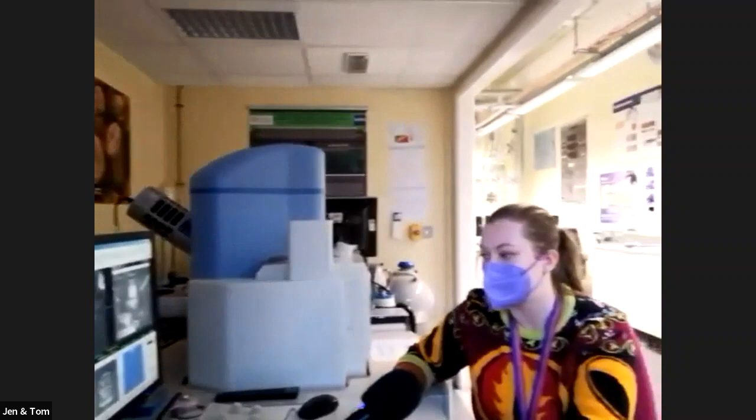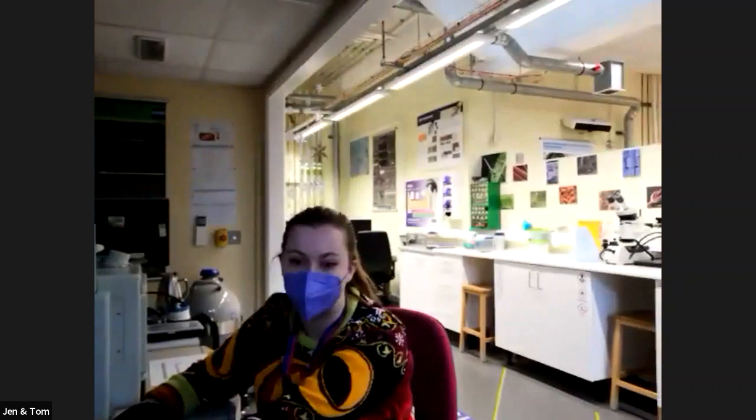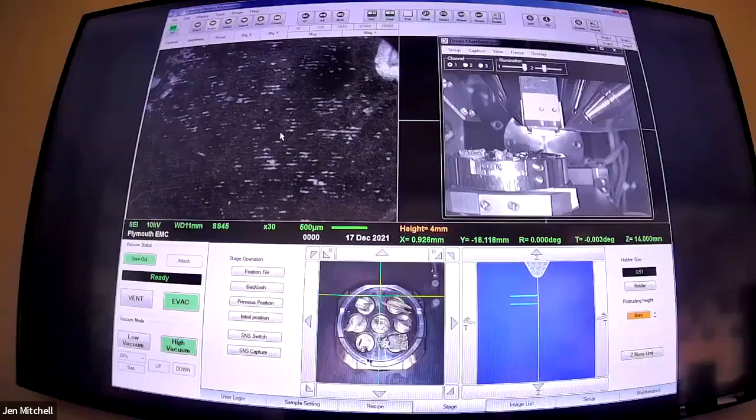We've got seven samples all up today, but we're saving one to last because it's our favourite. If you in the audience would like to suggest a number between one and six, we'll go on a mystery tour. We're using secondary electrons today, so just either plug your answer in the chat or just unmute and talk to us.